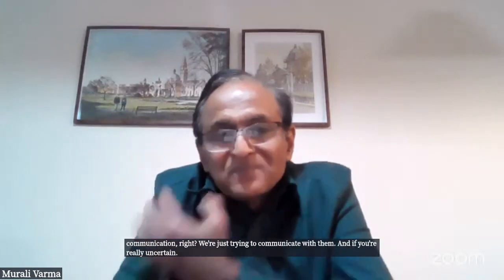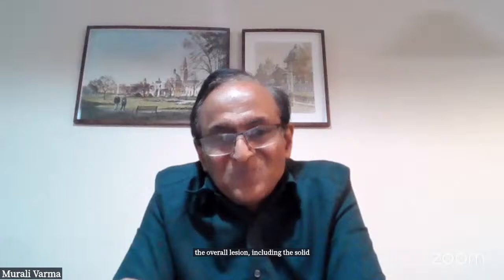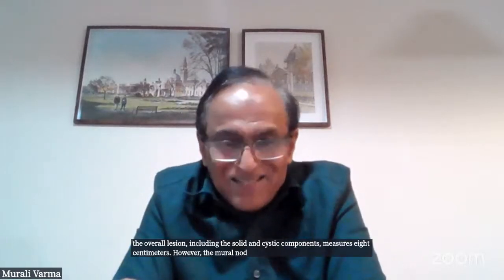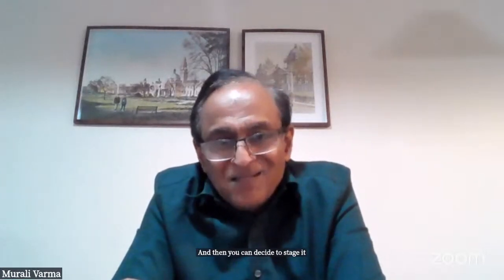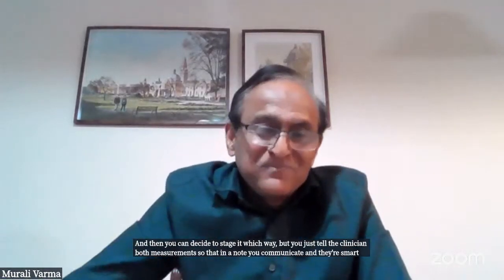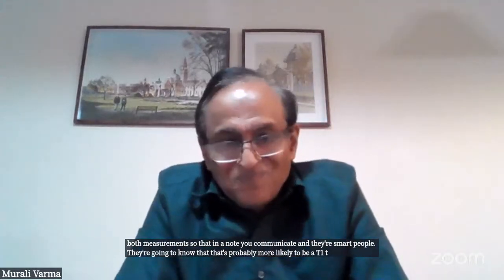Exactly. And if you're really uncertain, I'm happy to write a note on a case that says the overall lesion, including the solid and cystic components, measures 8 centimeters. However, the mural nodule measures 3. Right. And then you can decide to stage it which way, but you just tell the clinician both measurements so that in a note you communicate, and they're smart people. They're going to know that that's probably more likely to be a T1 tumor and not a T2, or whatever tumor.